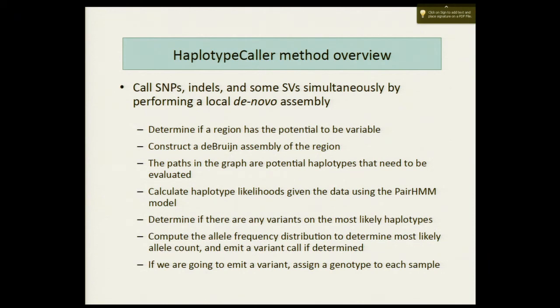That's why it's massively parallelizable, because you go to each locus independently. And you ask the question, what's the evidence for variation at this locus, using only the data that overlaps just that one locus. You make the decision for locus 1, and then you move to locus 2, and you start from scratch and redo everything again. So the fundamental difference really is that we're no longer treating reads as independent things, and we're looking in regions for variation instead of just independent loci.